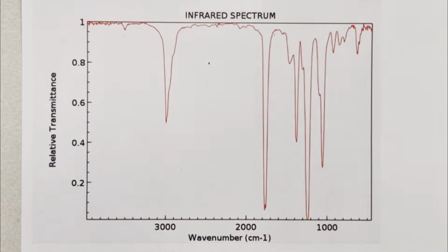Right then, guys, I'm going to finish with a slightly tricky example, but I bet you guys are really building confidence and you're going to blast this, and you've already spotted some key information you could talk about straight away. So let's show off how much you guys know. I would imagine you've already seen something really important, which is that sharp trough found around 1,700, which is indicative of that carbon double bond oxygen. Really well spotted if you've seen that already.